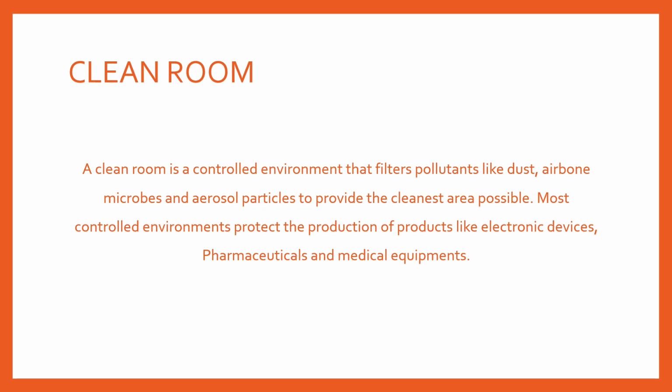So as you can see here, it is a particular area where the environment, that means the air as well as the pollutants, everything is being controlled, which helps in the decrease of pollutants like dust, airborne microbes, and aerosol particles, and provides us with the cleanest possible area.